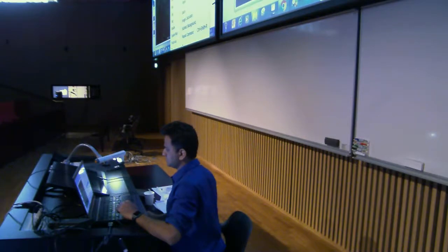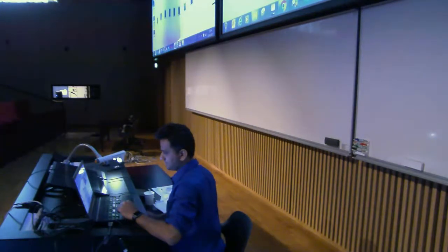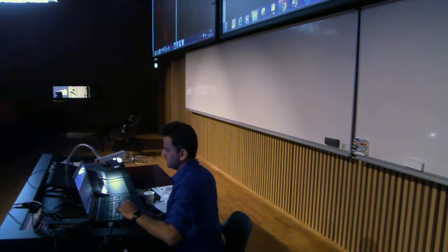It is also possible to make a binary, the arithmetic calculation over two images. So if we go to HeLa cell again, color, split channels, close it, and let's say I want to make one combined image out of these two.